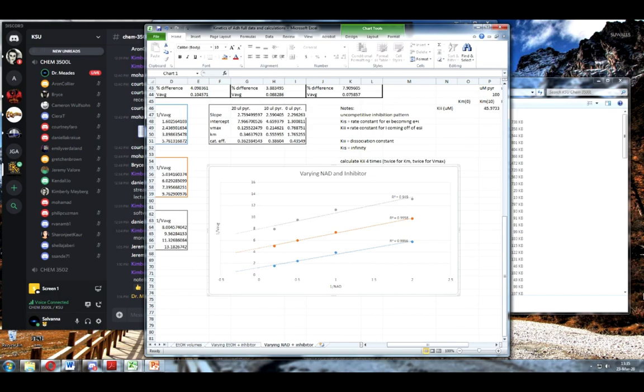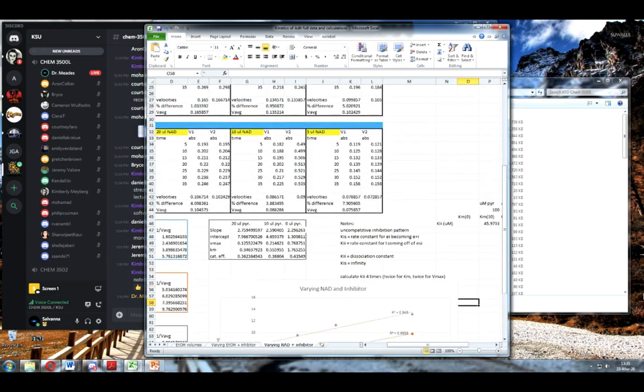These are the exact same ones I just did, the 9, 8, 6. This was the one I just plotted. It was really close. And this one's really off, right? And that's the hard one to get because it's got all that inhibitor in there. So the numbers are hard to calculate correctly. The main reason is you're limited by the specs you have, right?